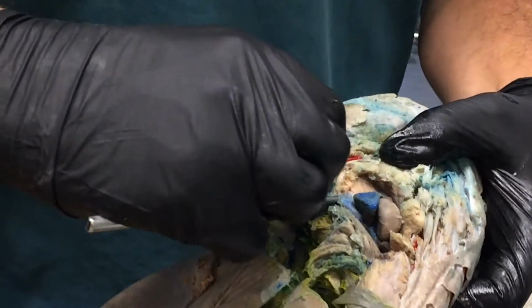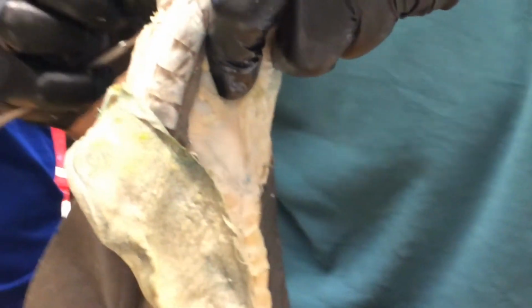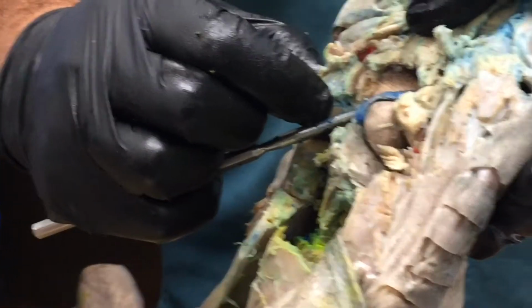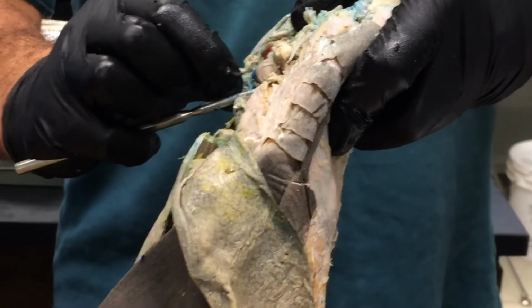Not really? Right there? Okay. That's the inferior jugular vein coming back into the common cardinal. Oh, wow. Okay. And it's really hard to actually dissect this out, but it's very easy to probe for it in this region and find it.